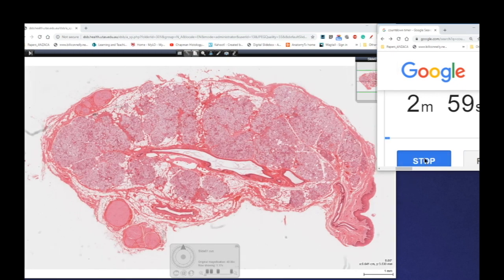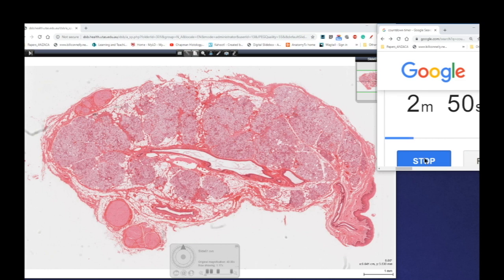Stratified cuboidal or stratified columnar epithelium are almost exclusively found in the large excretory ducts of the major glands of the human body. In this case, we're actually looking at a section of one of the major salivary glands — specifically a section of the sublingual salivary gland.